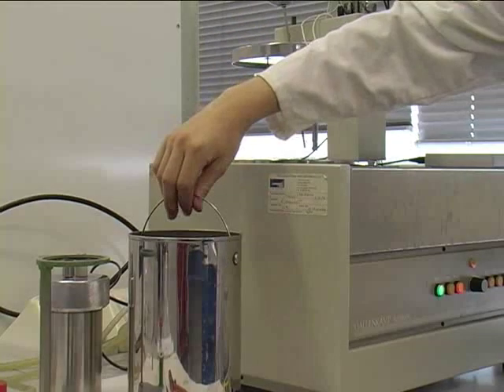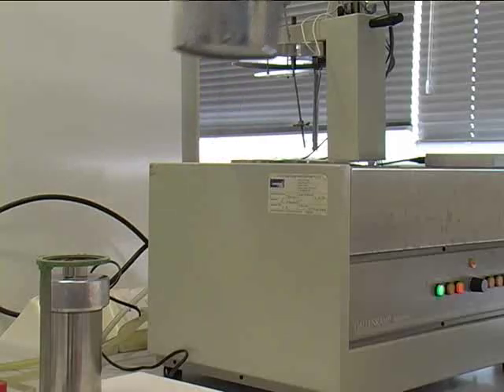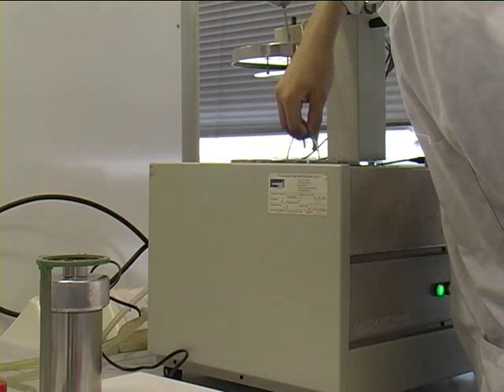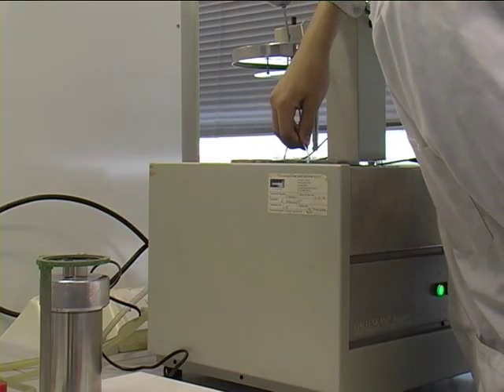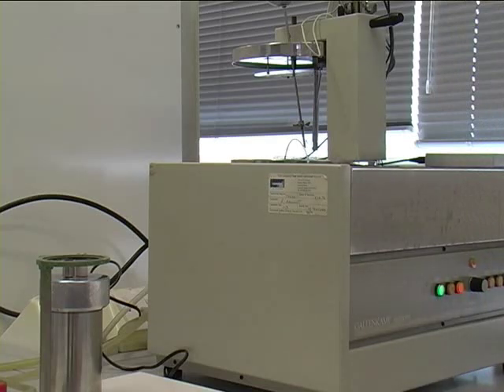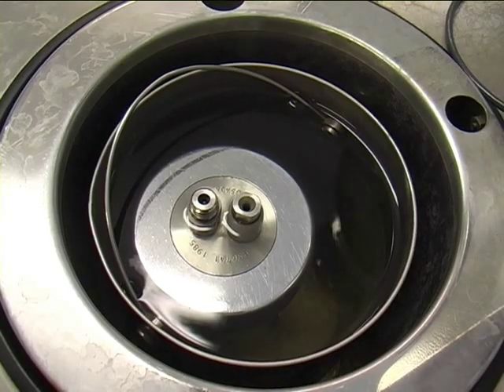The calorimeter is now assembled. A can of water is inserted. The can plus its contents weigh exactly 3 kilos. The assembled and pressurized bomb is then inserted in the can.